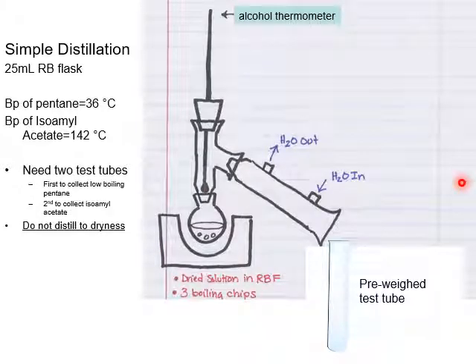At the end, you need to do simple distillation. I believe based on your previous experiments, you are familiar with the distillation system. After assembling and doing the simple distillation, you will have your product at the end, and you need to collect it in a test tube.